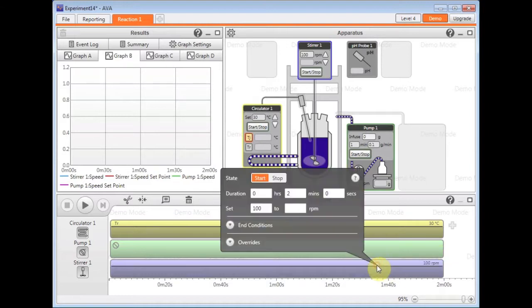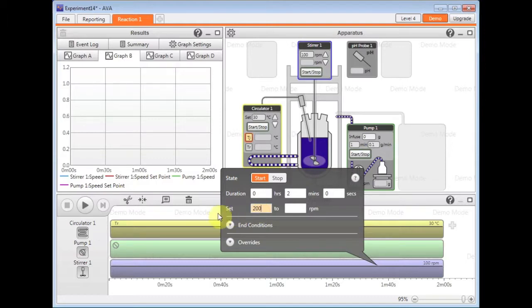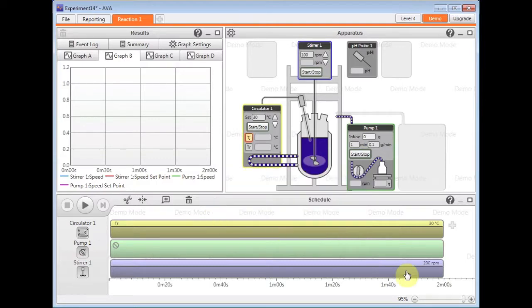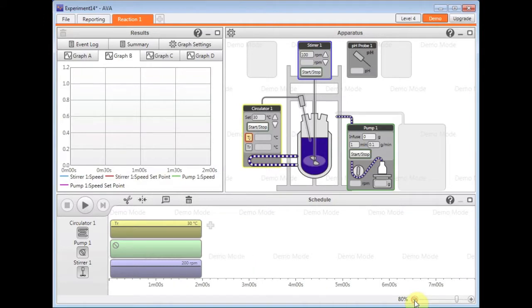If I just click on the bottom here, the stirrer becomes active, 200 rpm for example. It's going to zoom out a little.